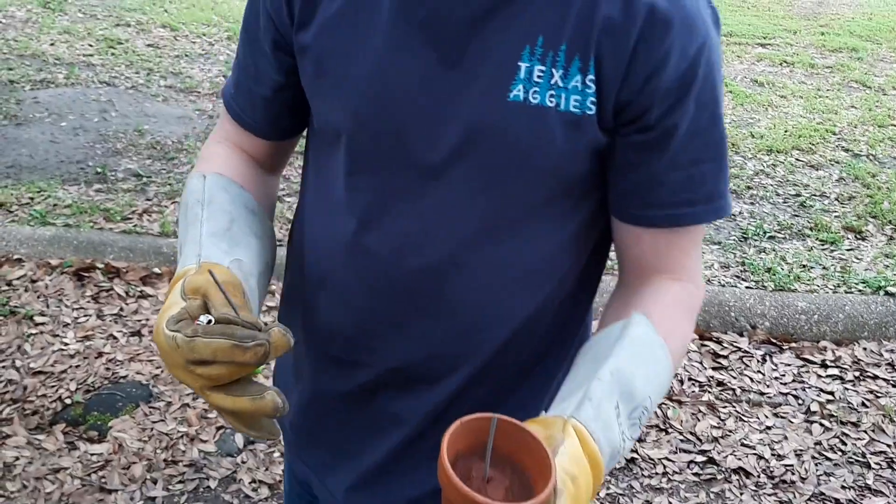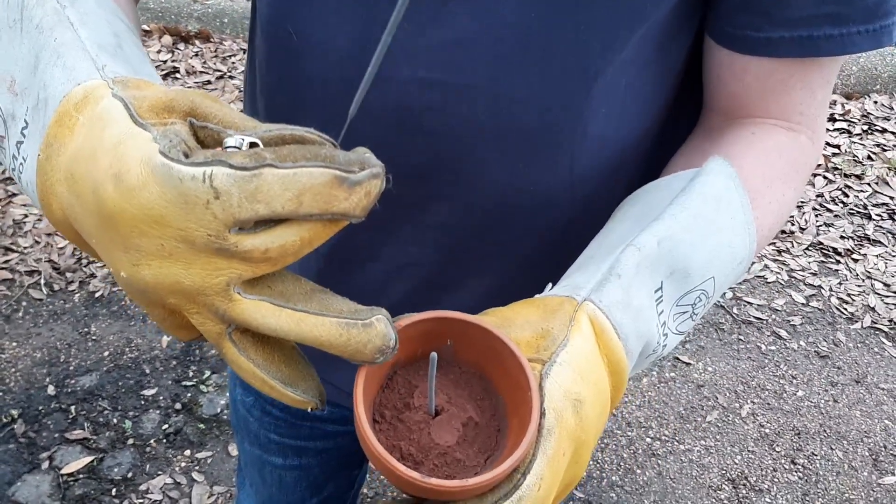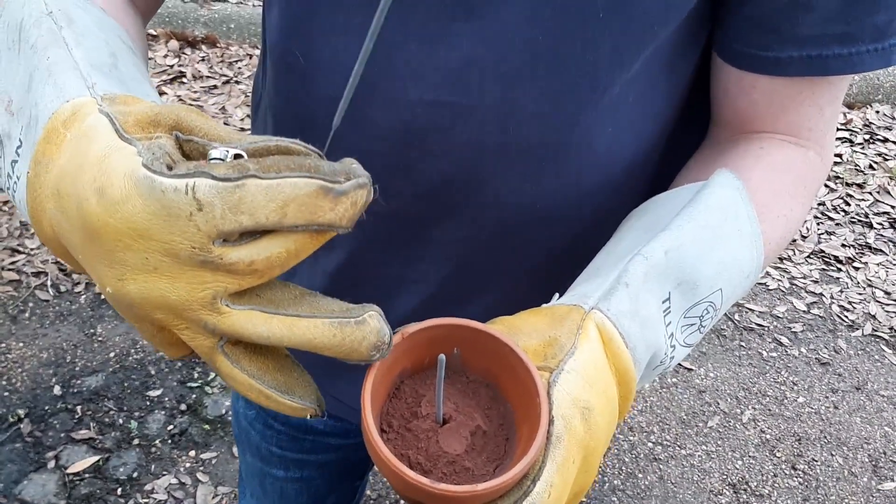For this reaction you need to have prepared a 1 to 3 ratio by mass of aluminum to iron(III) oxide.